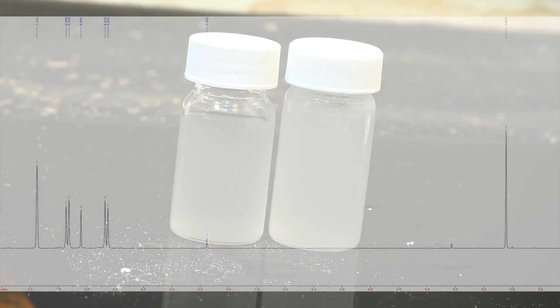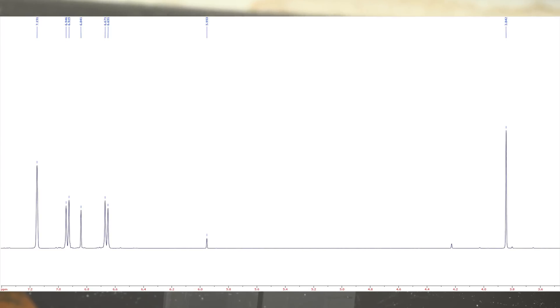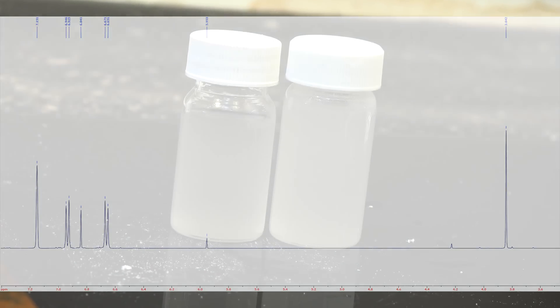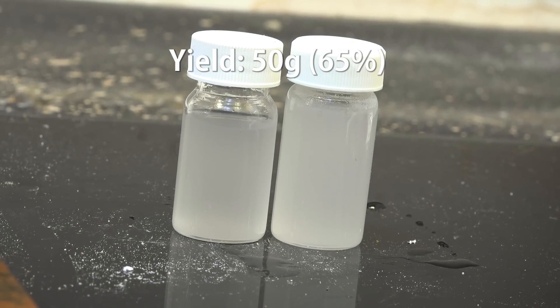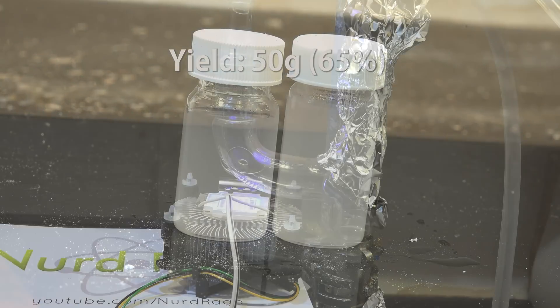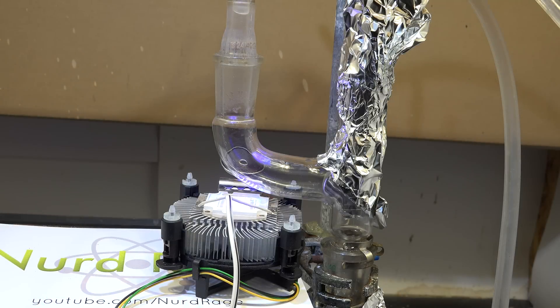And there we have it, p-chlorobenzyl chloride. Here is the NMR spectrum proving we have a relatively pure product. My yield was 50 grams or about 65%. I think if I just slowed down the chlorine addition to prevent burning and better mixed the chlorine I would have better yield.